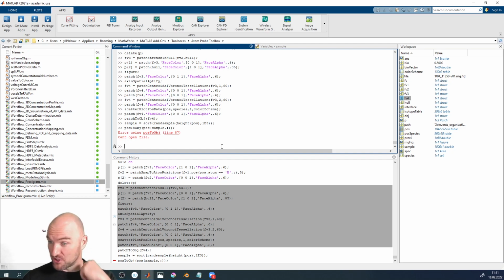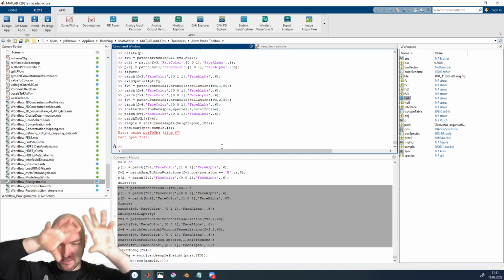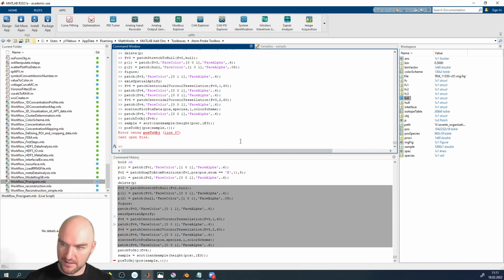Okay, so how do we generalize that to an n-dimensional analysis? But first, maybe apply it to a proximity histogram. The way we do that is we voxelize our data. We already had voxelization when we were talking about isosurfaces. An isosurface is based on a voxelization of a data set in 3D. But this is now a one-dimensional voxelization. This is why we call it ND analysis, because you can use any dimension you want.